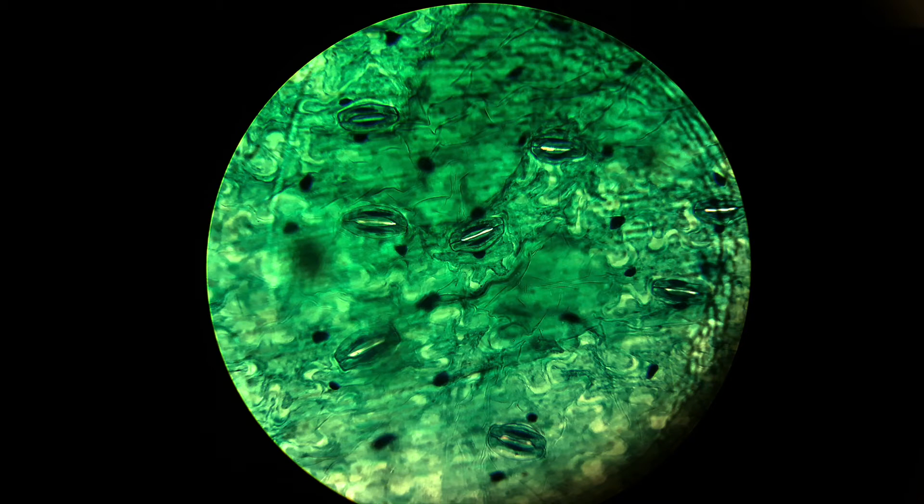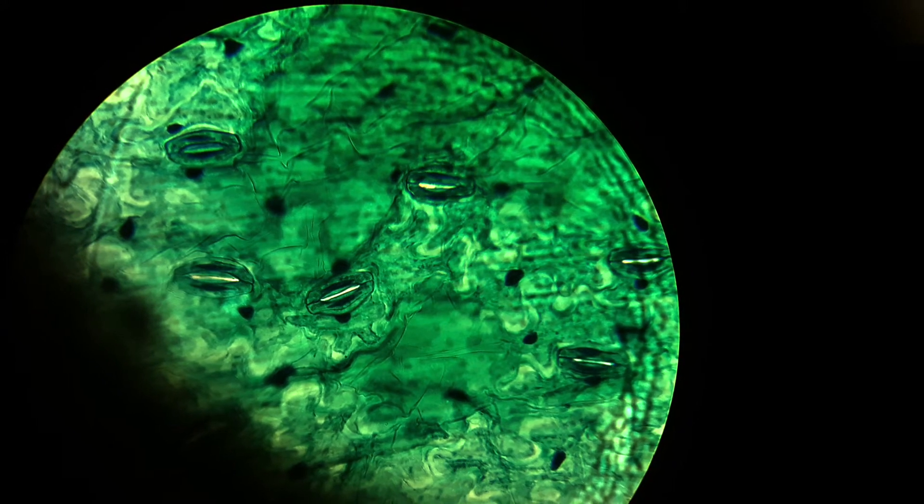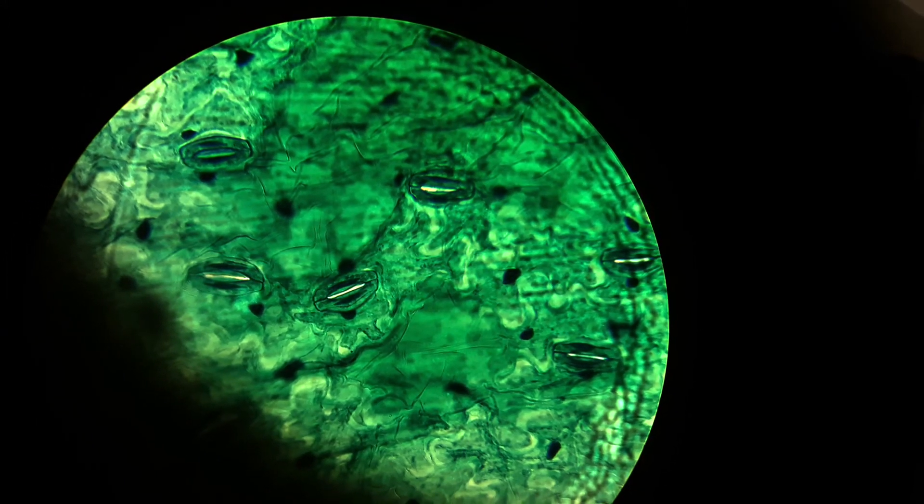Stomata are tiny openings present on the epidermis of leaves. In some plants, stomata are present on stems and other parts of plants.